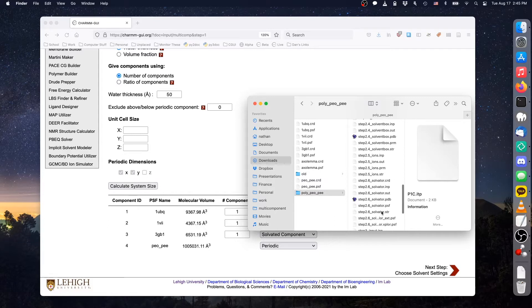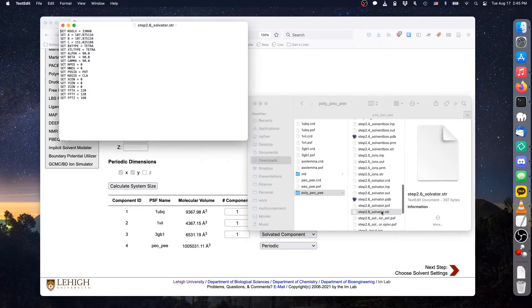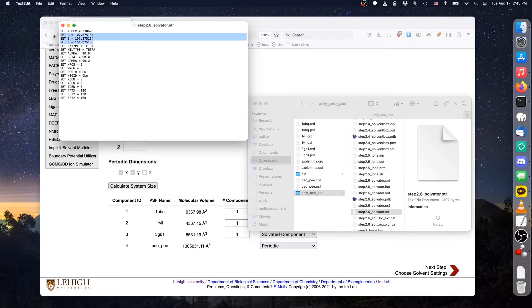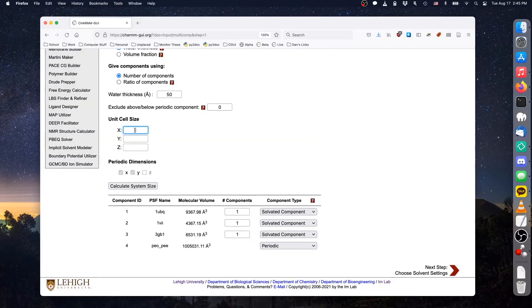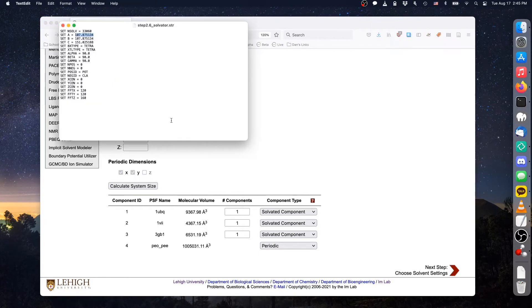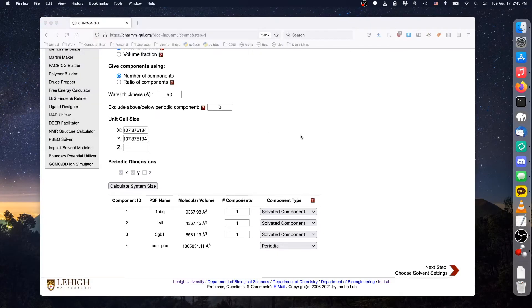For solvated polymers, this is given in step 2.6_solvator.str, where A, B, and C corresponds to X, Y, and Z respectively. For packing purposes, this will cause the polymer to be treated as a 151 angstrom-thick membrane. Solvated components will be placed outside of this region, in a layer of water added above and below the periodic component, whose thickness is given by the water thickness option.